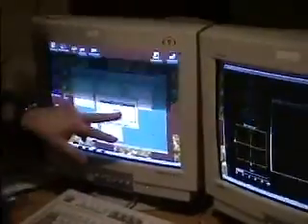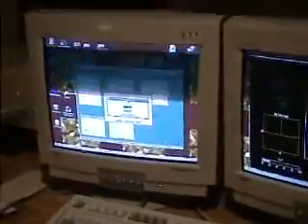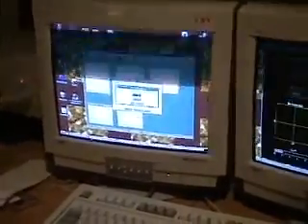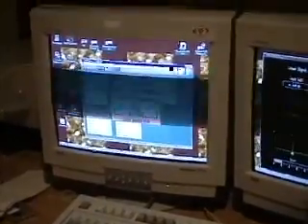So I'm still in this engage window. I might as well, before I do the tuning, withdraw in preparation for putting my sample in. So I'm going to just lean on that until it's good and high so I can slide my sample in without having to worry about anything.